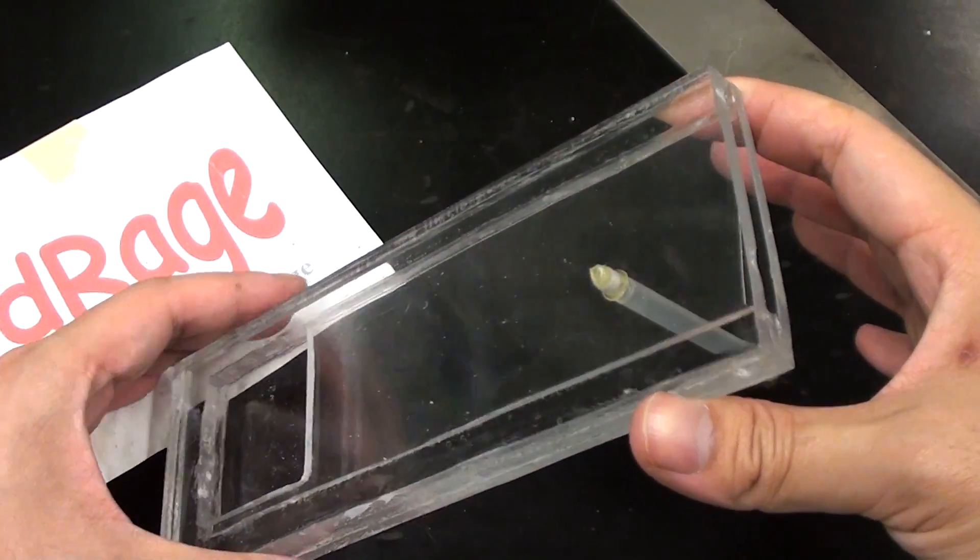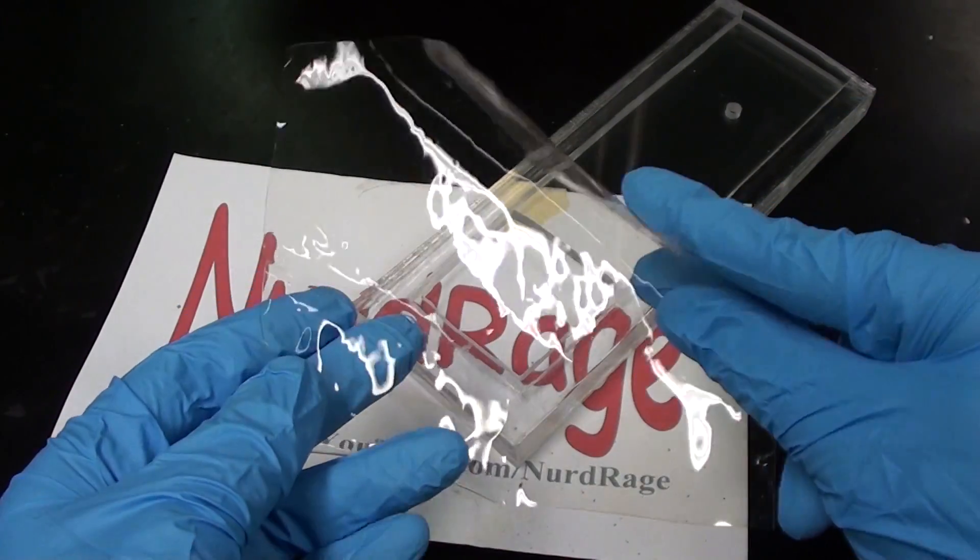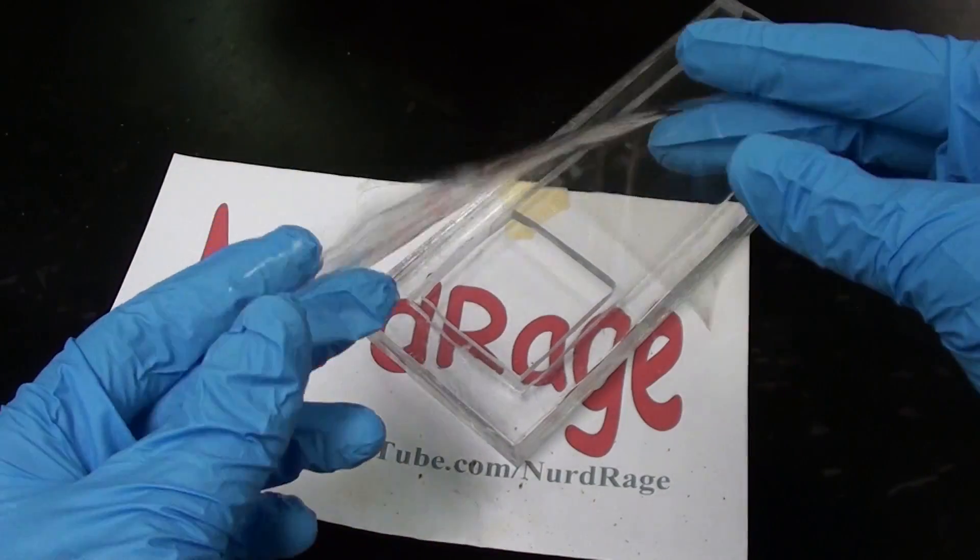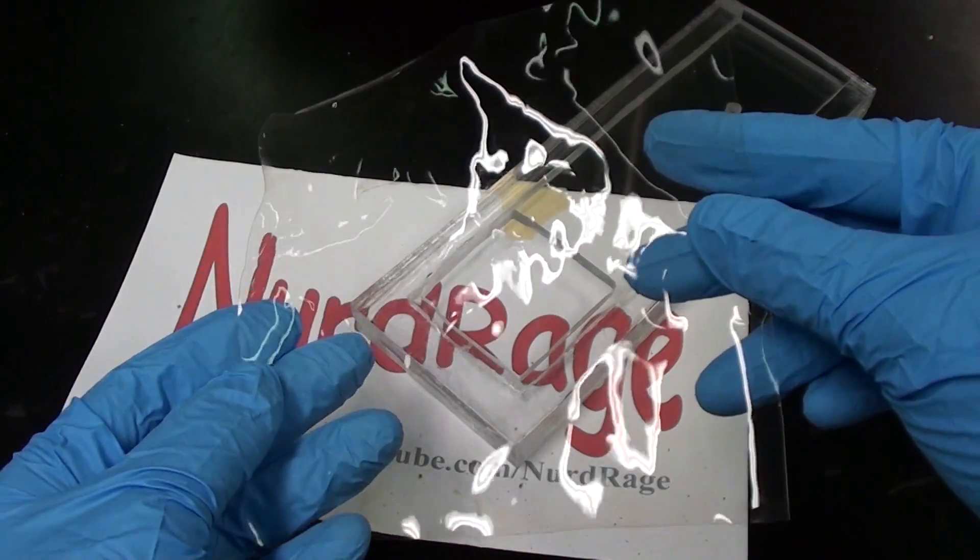All that's left now is to install the membrane. So here is the big reveal, the famous Nafion membrane, which is incredibly boring and looks exactly like plastic wrap.